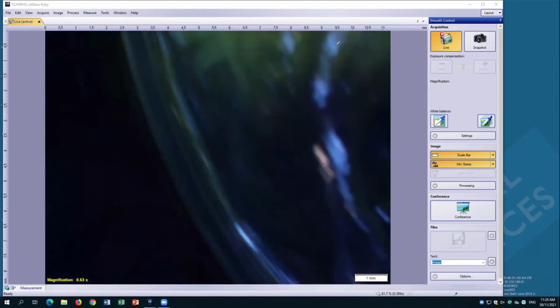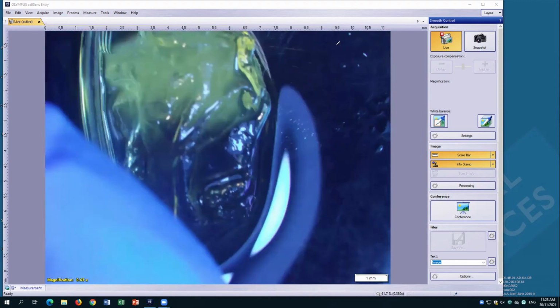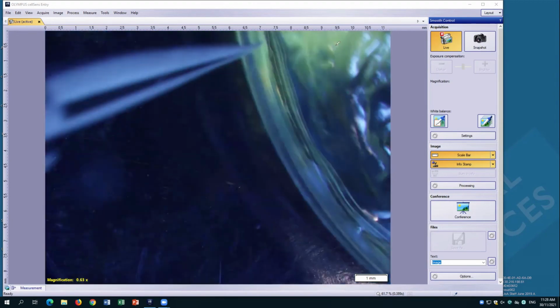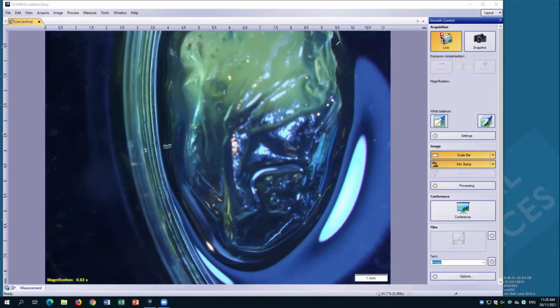I might just finish with one exciting note, because I love visualization, and hopefully throughout this demonstration it will show that I love my work. So shown here is the same sheep cochlea as I've shown before, but now I'm trying out this new thing for tissue clearing.